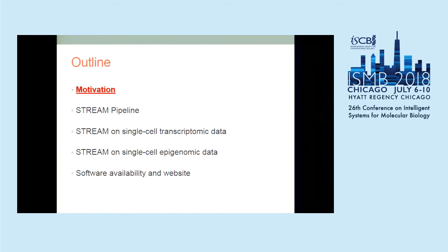I will walk you through the following 5 aspects: how we started this project and how our method works, and the application of STREAM on both single-cell transcriptomic data set and epigenomic data set. And in the end, I will show you our software and interactive website.